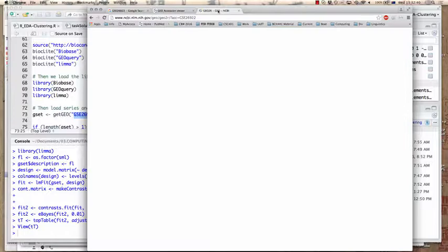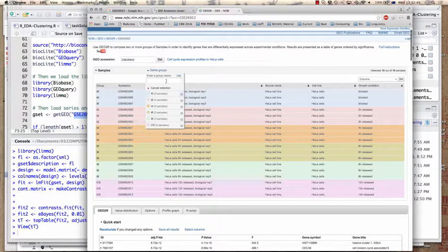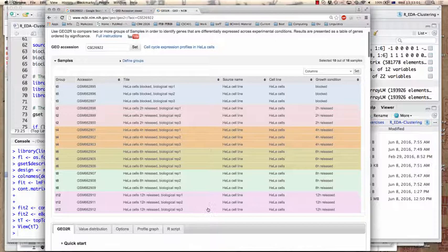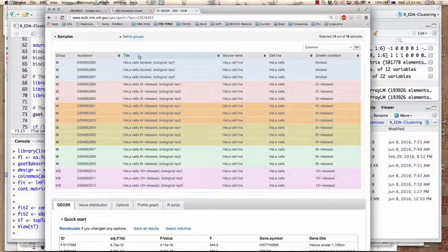Geo2R is a tool where you can work with datasets. The dataset has microarray results for 18 different experiments — three control experiments, three experiments at two hours, so six time points with three biological replicates each.